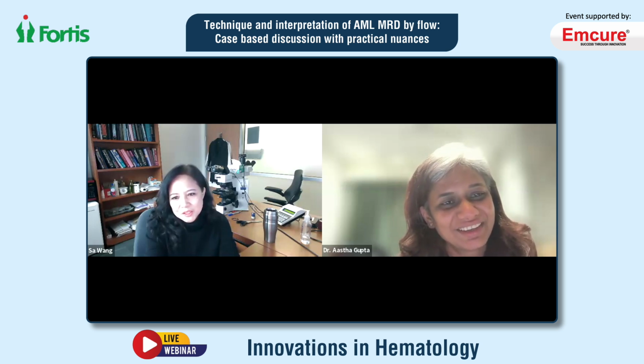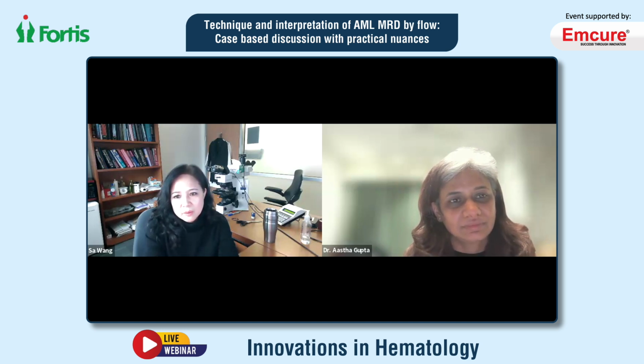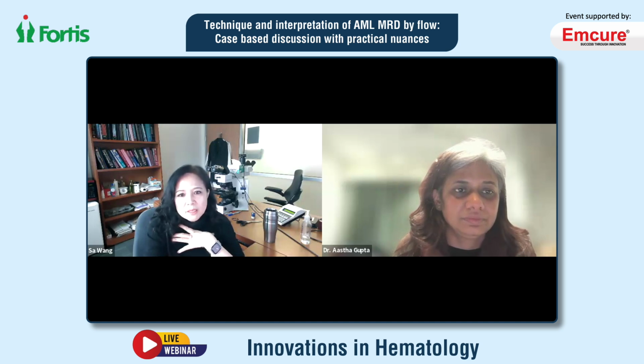That's actually a very good question. What do you all consider as adequacy or inadequacy? Yesterday we had a lot of discussion within the EON group. For us, we count sample adequacy, which of course applies more to the negative case, right? The positive you can call on a poor quality sample. But the bottom line is, I think your question is how many events you want to see in order to call it positive.